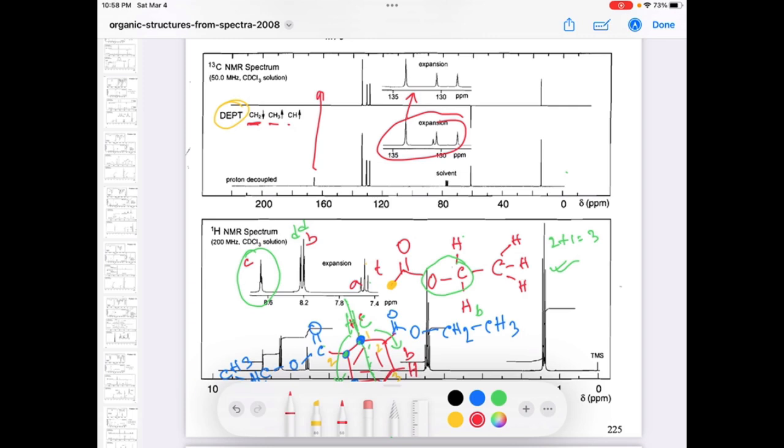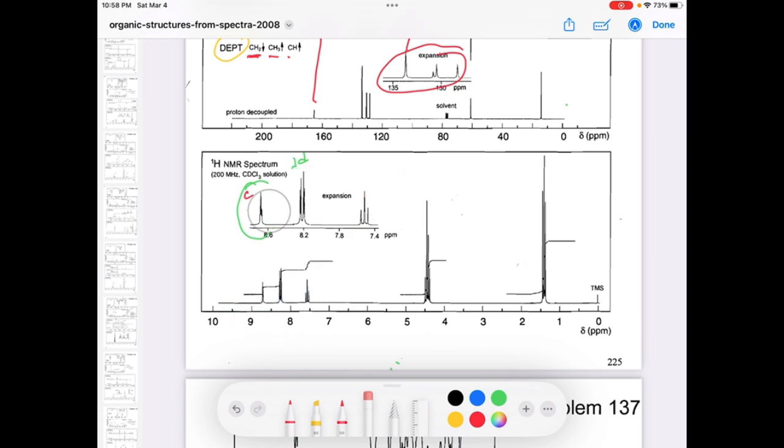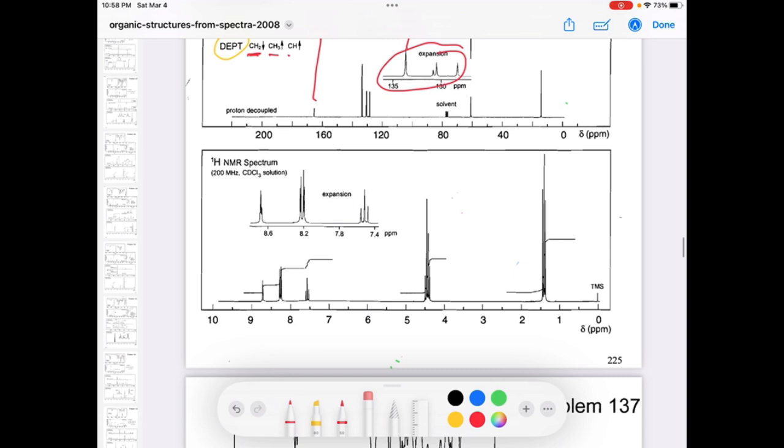Let's draw again in a fresh way. So what we have from the carbon NMR, the proton NMR, and the IR: from the IR and the proton NMR, we got that we have an ester group like this, which has a CH2 next to the oxygen and a CH3. Now we designed that our benzene ring should be in a symmetric situation. So we have this carbon again, with this CH2 next to it and also this CH3.